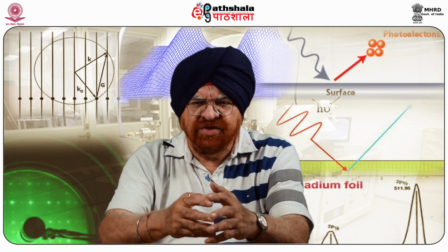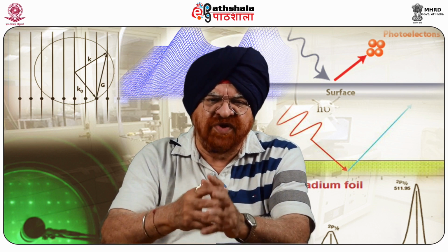Then the most important factor here is ease of interpretation. After having recorded the ESCA, the interpretation is very, very simple, and both what is there on the surface and how much is there can be very precisely answered.